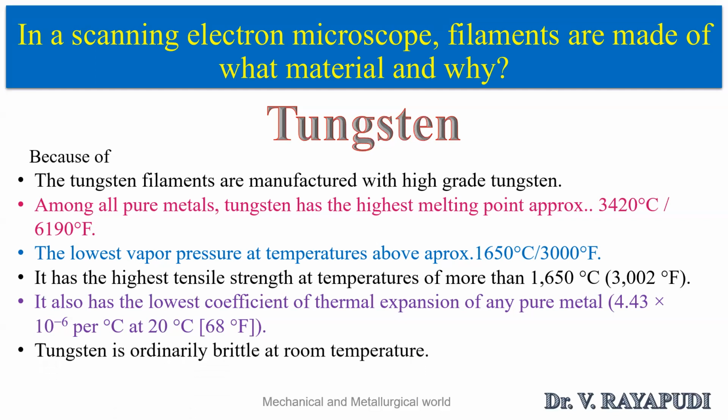And tungsten is ordinarily brittle at room temperature, but at high temperatures we can make it into a wire. And this combination of properties makes tungsten the ideal material.